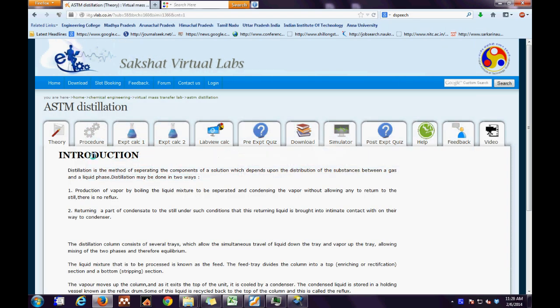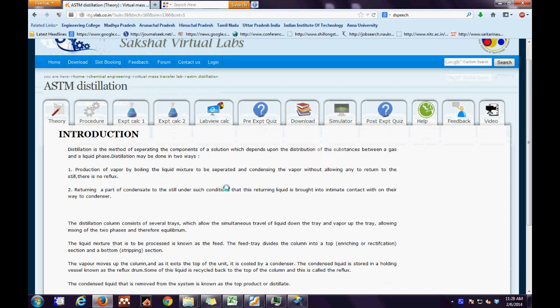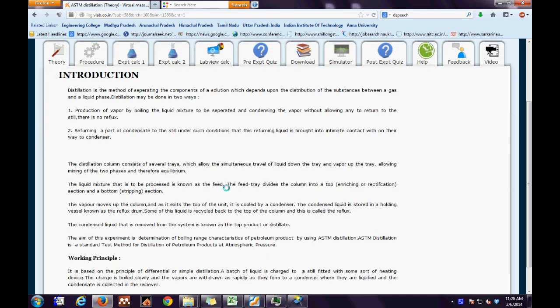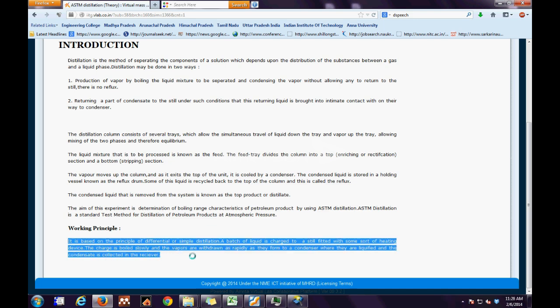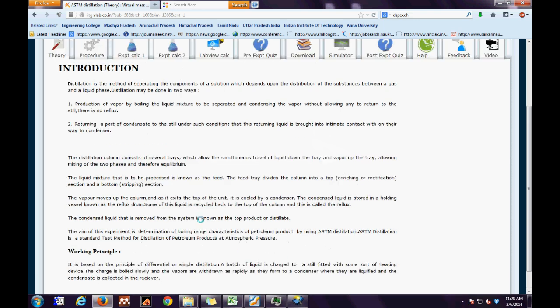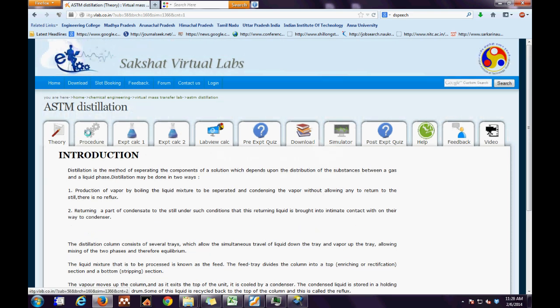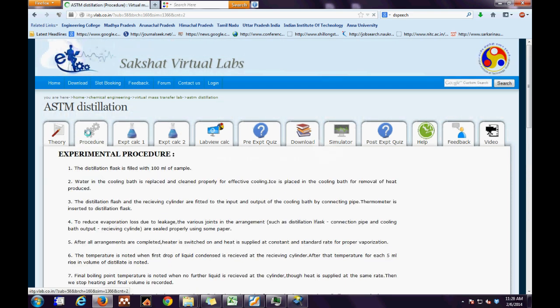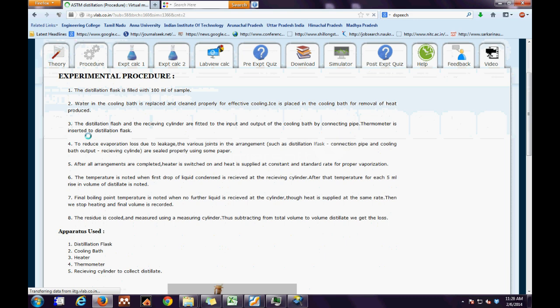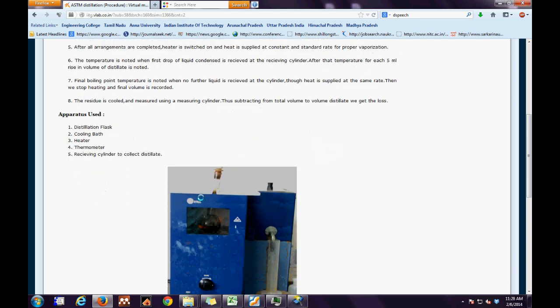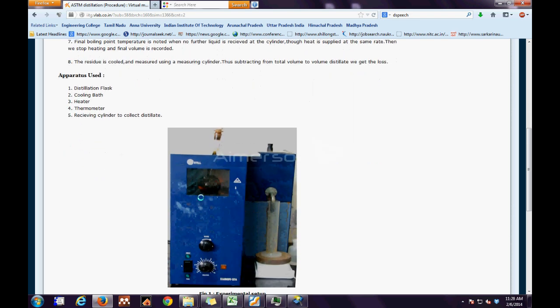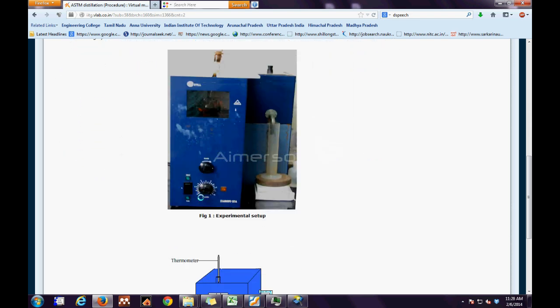On the online portal, the first tab is the theory tab, which gives us a general overview behind the experiment along with the working principle of it. The second tab is the procedure tab, which gives us a detailed explanation of the experimental procedure along with the apparatus used. It further gives us a schematic of the experimental setup along with the animation for the scene.